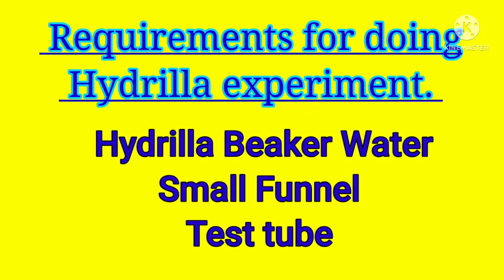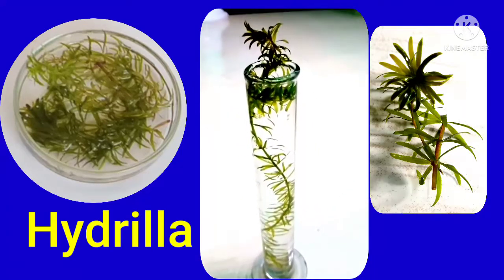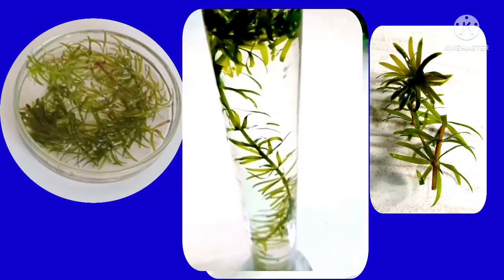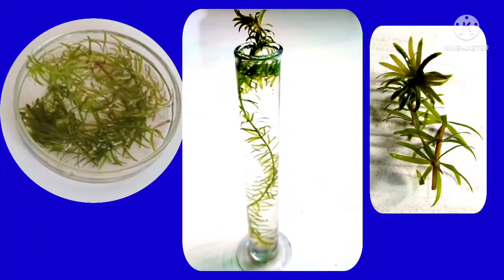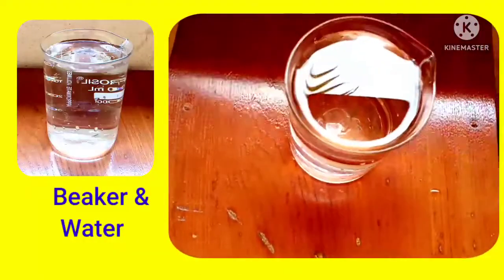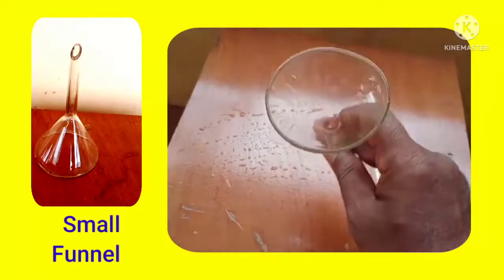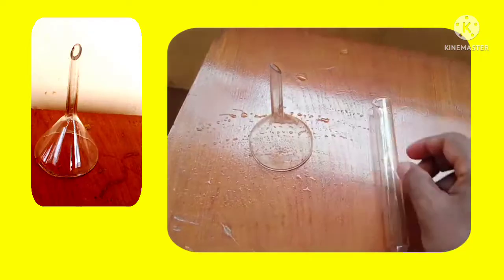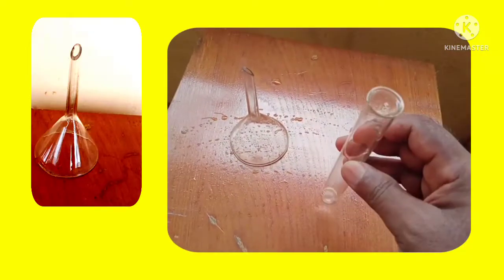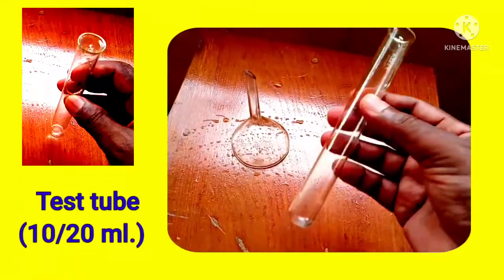The requirements for doing this experiment include the Hydrilla plant, which is a water plant living in ponds and rivers. We also need a beaker containing water, a small glass funnel, and a 10 ml or 20 ml test tube.